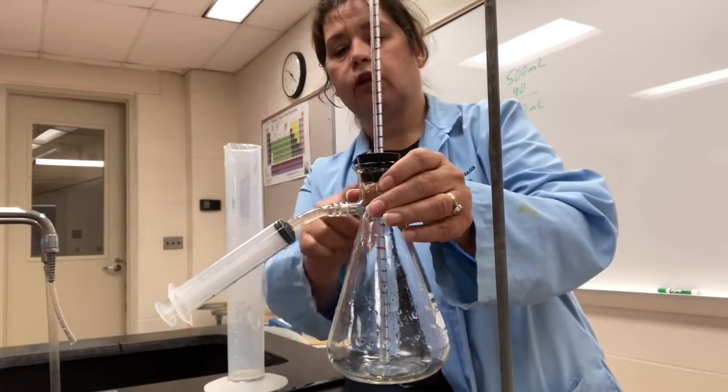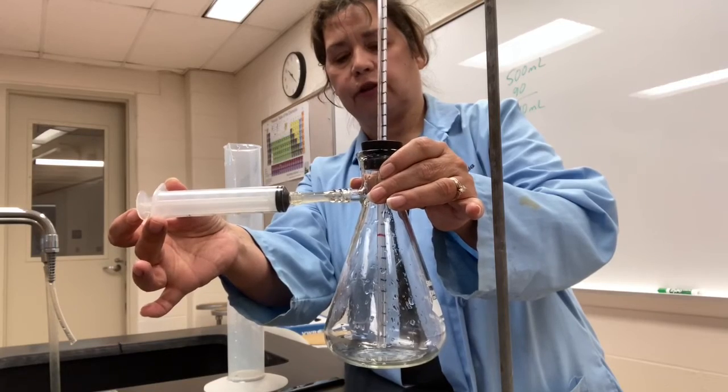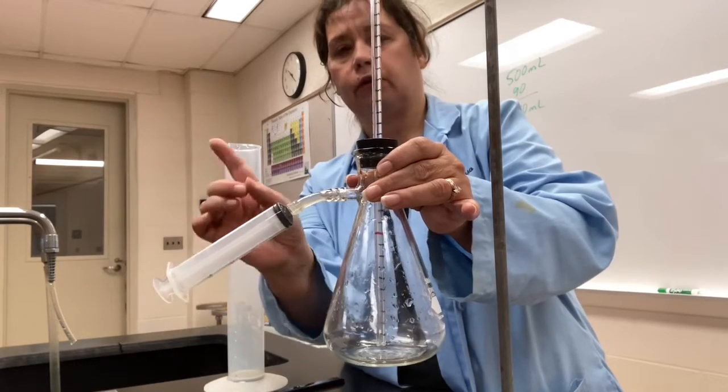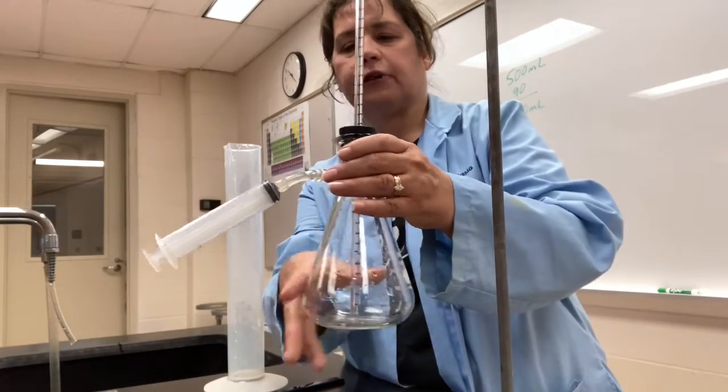This will enclose our volume. The way we'll change the volume is by changing the volume on the syringe. So the first thing that we are going to do is measure the volume that's inside this filter flask.